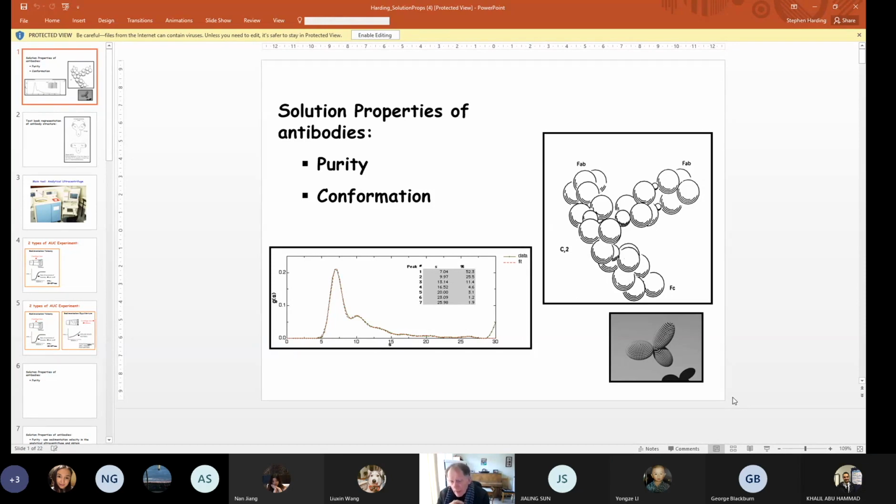Did anybody name an antibody which has an absence or almost a complete absence of a hinge region? I think IgG1. That's got a short hinge region, but still significant, as IgG2, IgG4.